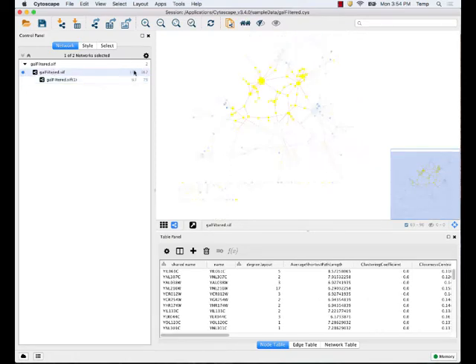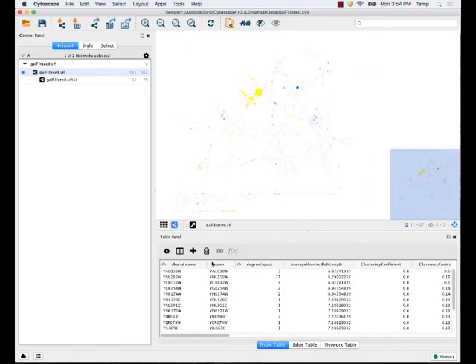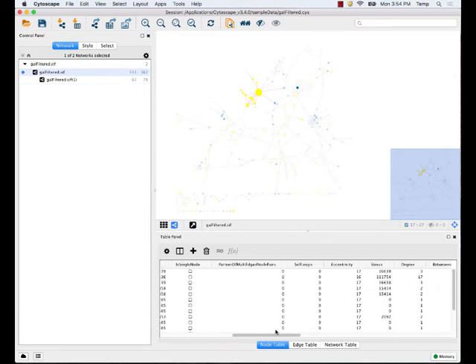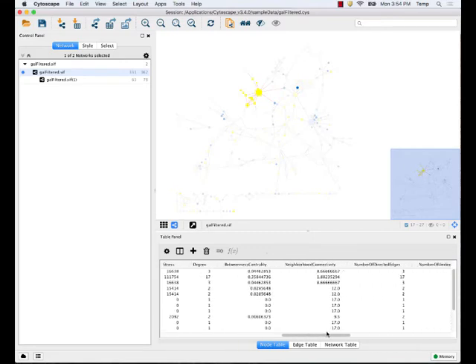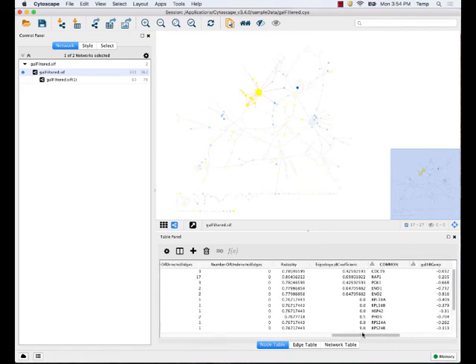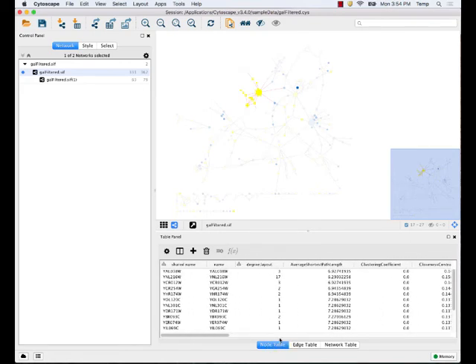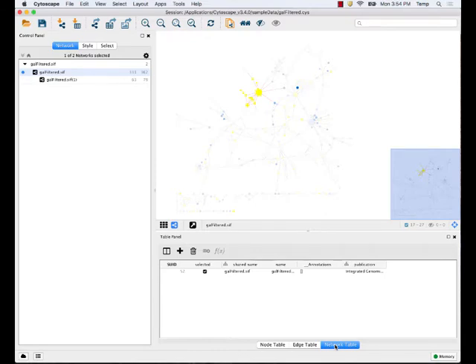These numbers here show you the number of nodes and edges. Importantly, if you click on a node or select a set of nodes, you can see information about these nodes. This information is loaded from the session file, but you can actually add your own data. The node table shows information about nodes, and the edge table shows information about edges. Additional tabs can pop up with different apps.